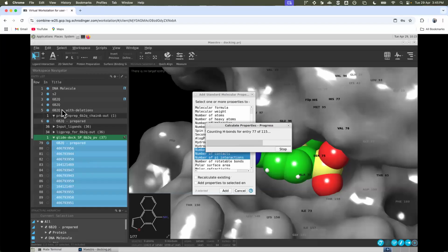I just unselected some entry, the enumeration. There were 1,000 compounds there. I think Vinod or someone showed that enumeration. So I just deleted that one, and it is basically calculating for all the others. Are you guys able to calculate? Yes, no?